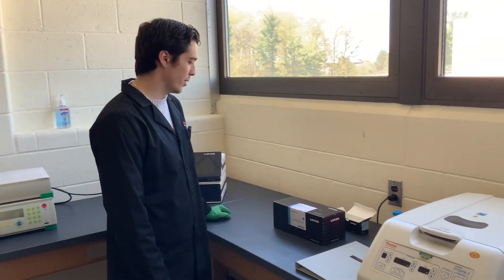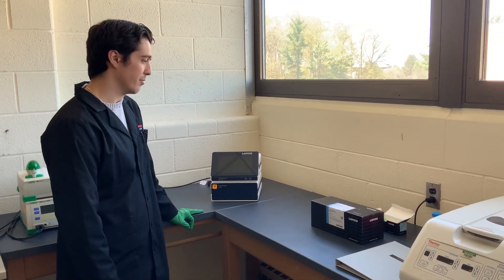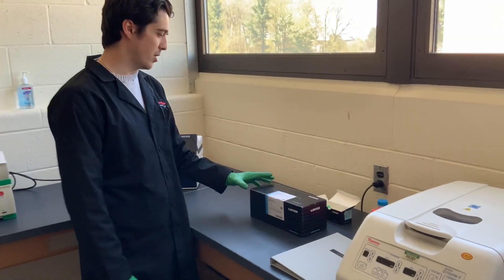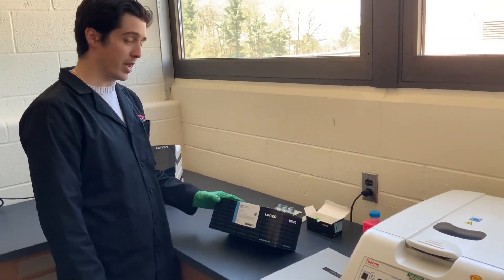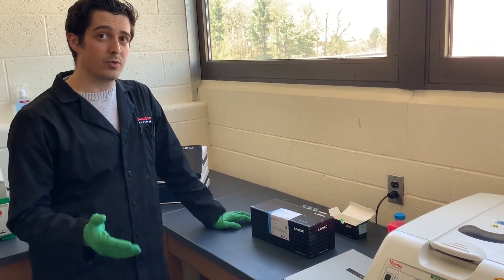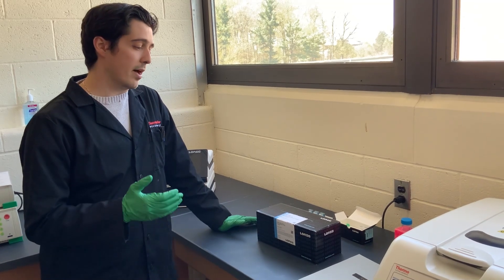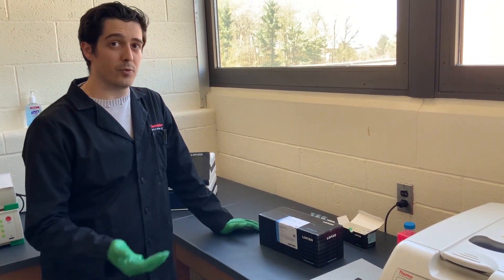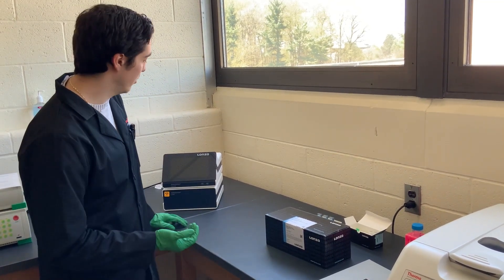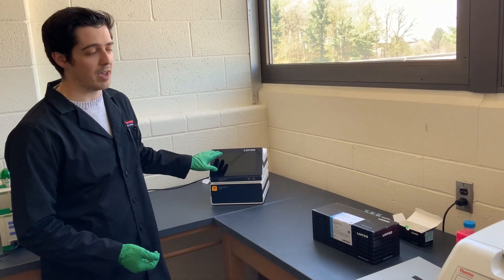Hello, today I'm going to teach you how to use the Lonza 4D Nucleofector Kit. Before we start, I want to talk about some of the different reagents you can get from Lonza. There are different kits you can buy, and depending on which cell line you're using, the kit and reagents will vary. You want to make sure you're getting the appropriate kit that is compatible with the 4D Nucleofector, which is the model we have here.